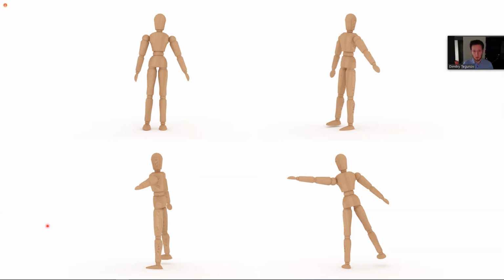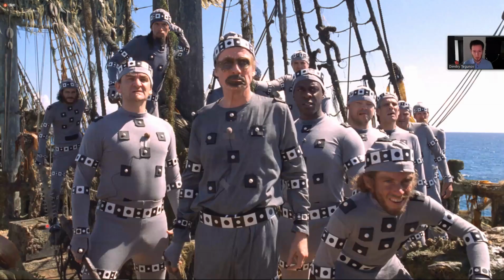Now, if we wanted to correct this, we could try to track the motion, like here, for example, with fiducials. And sure enough, we can place gold fiducials into our samples and then try to track them, assuming they're perfect spheres. But usually this does not work with high accuracy, and it's also very hard to distribute them uniformly inside the sample. And for in situ samples, it's often even impossible to put them into the sample. But luckily, our in situ samples have plenty of natural fiducials, like the pattern on the skin here. Those are the proteins themselves.